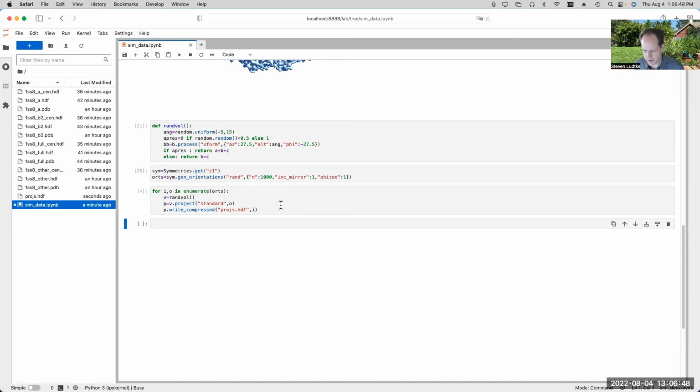Since we haven't talked about CTF yet, next week we can either talk about the CTF and adding noise to make proper projections, or we can just jump into doing the GMM on the noise-free data and talk about the noise later. We'll see how things go. The CTF and noise stuff actually shouldn't take very long now that we've done the tough part. Getting all these orientations right was really the hard part of this process. The CTF can be handled in just a few lines, but I don't want to take any longer today.